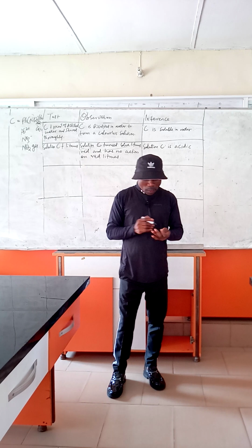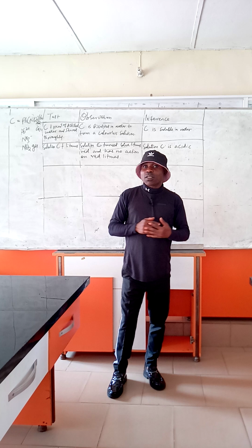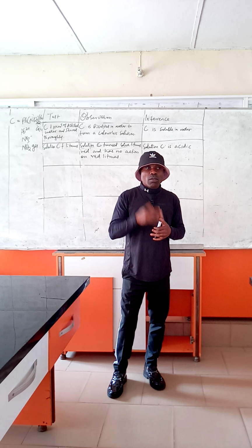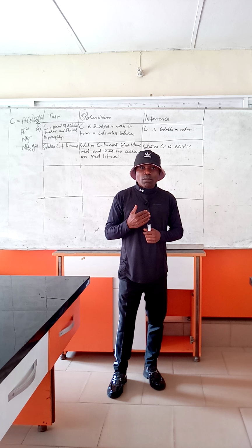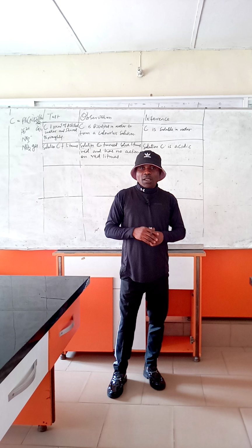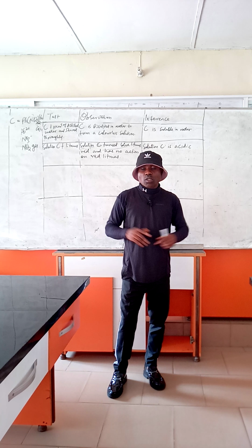Now you could also be expected to test whether the dissolution of salt C is endothermic or exothermic. Now you feel the wall of the test tube. If the test tube felt warm to touch, it means that dissolution of salt C in water is exothermic.